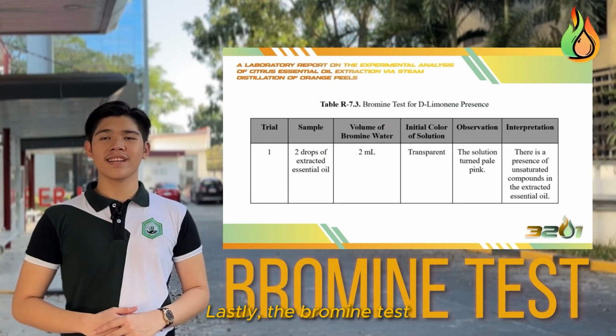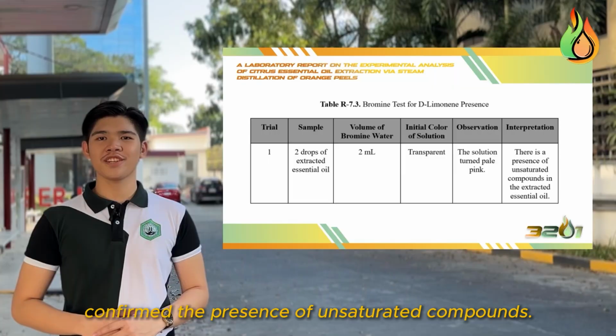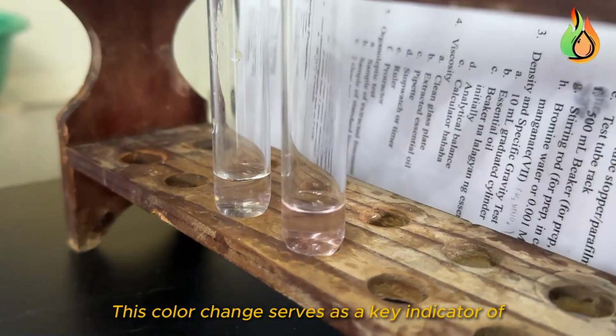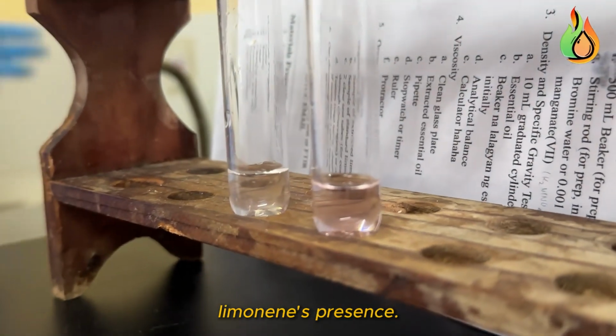Lastly, the bromine test confirmed the presence of unsaturated compounds. The solution, initially clear, turned pale pink. This color change serves as a key indicator of limonene's presence.